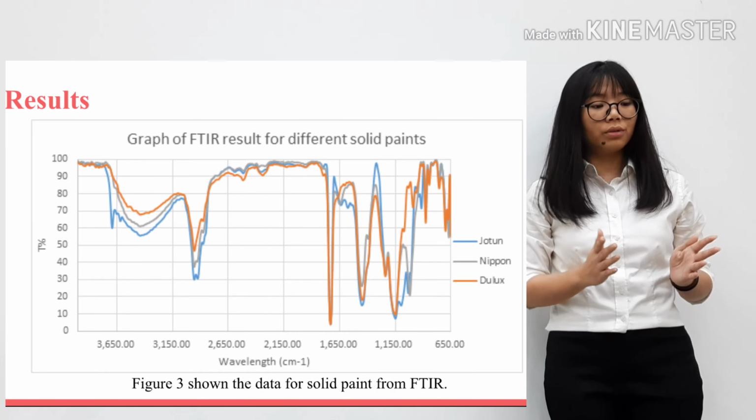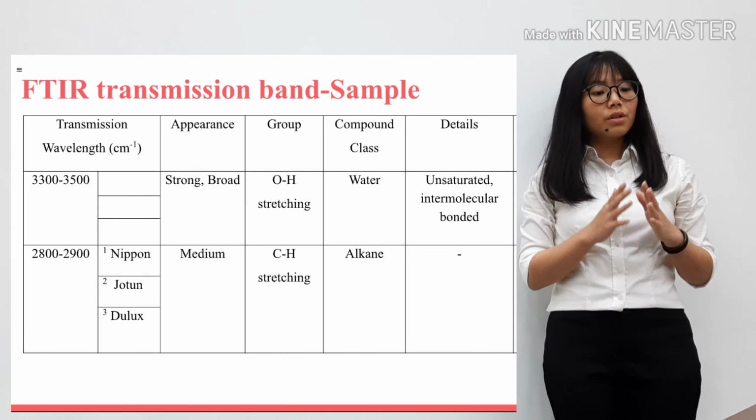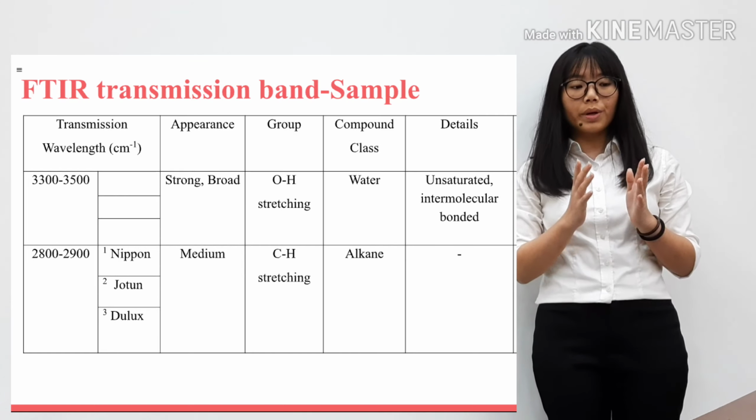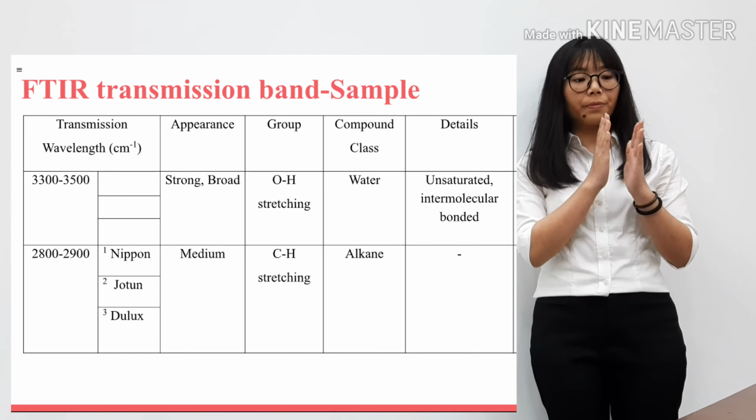So there's a difference. Here I'm going to show how we interpret the result. You can see there's a table with the transmission wavelength. We have determined the wavelength according to the reference.